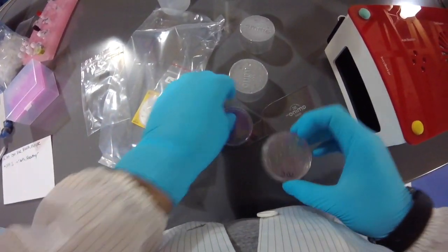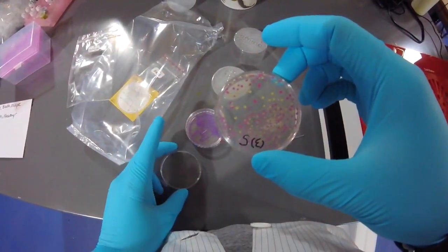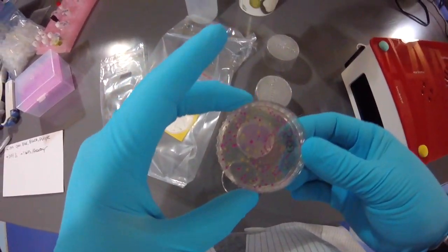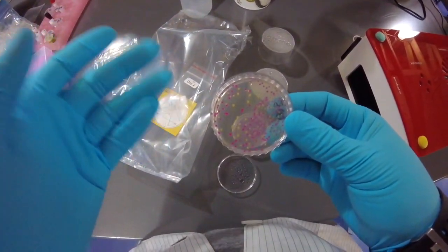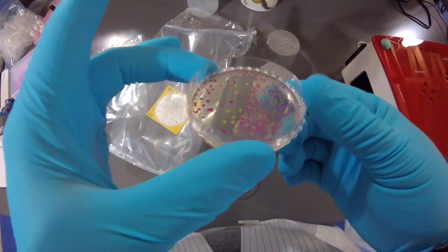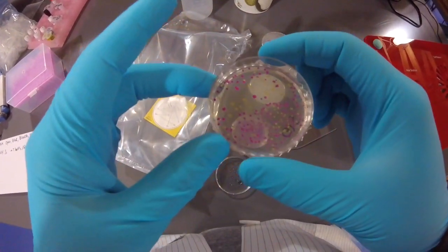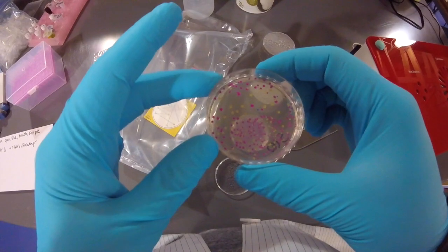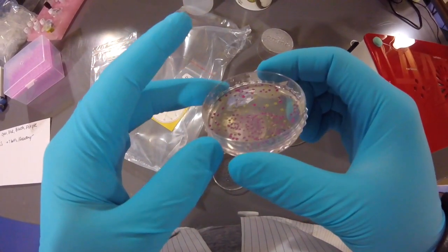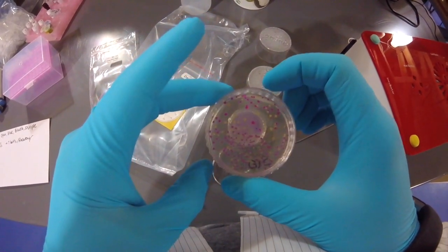Okay. All right, and so now we have our experimental sample, and this is from the actual DNA that we transformed the cells with. You can see there's actually many different colors here. We've got some fuchsia, we've got some orangey yellow, we've got some blue, so a few different colors. That's pretty exciting, and I haven't counted, but there's got to be between 15 and 100 colonies there, maybe a little bit more than 100. So that's a pretty good result. All right.